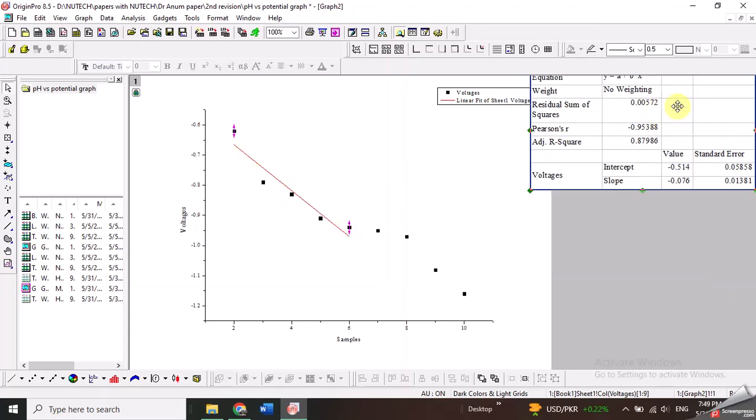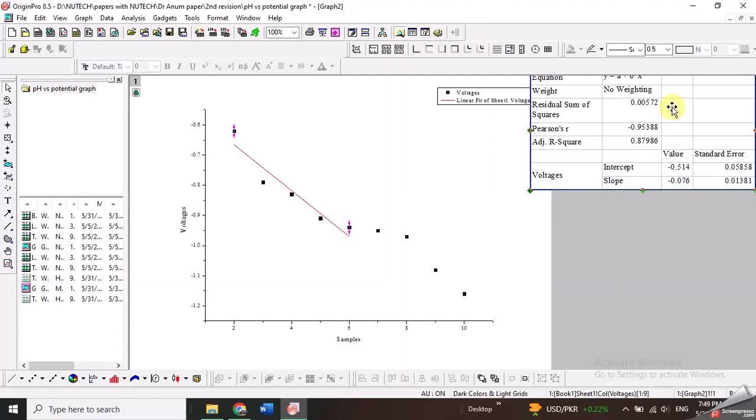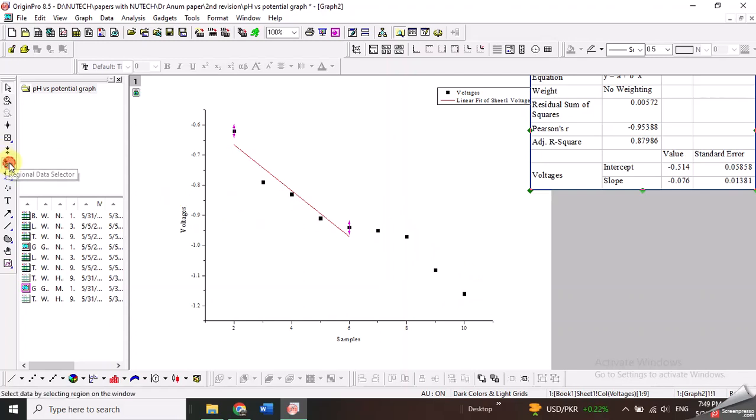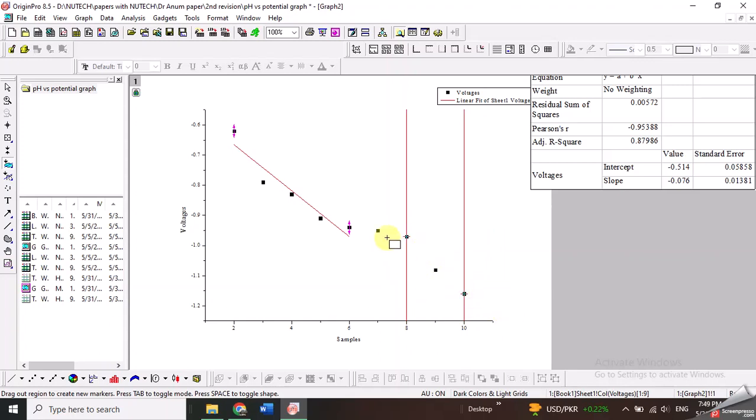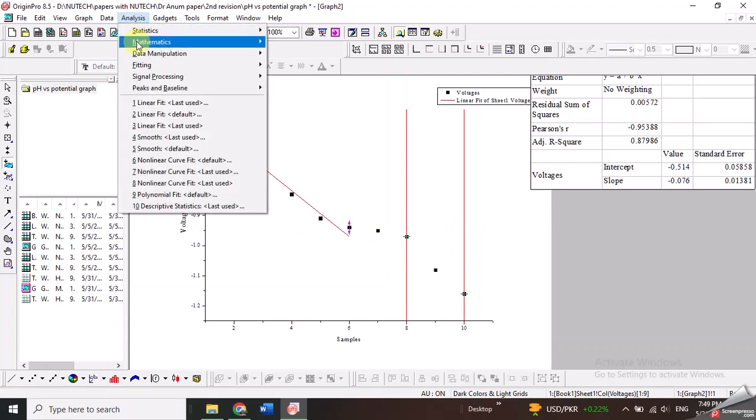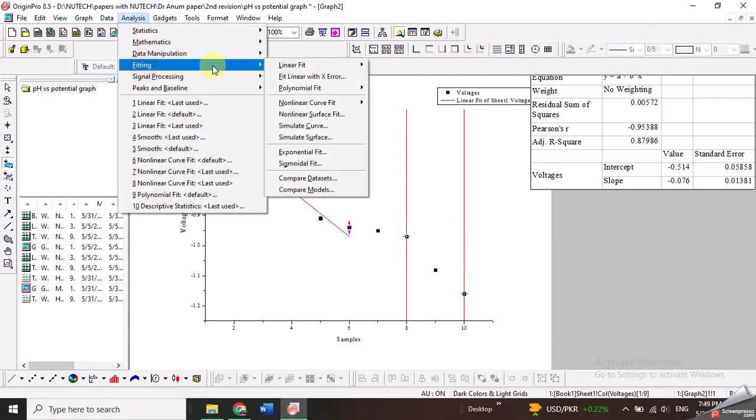Now I want to draw another straight line for these data points. Again, I will go to the regional data selector and click this region. You will again see these red lines which indicate the selected data. Go to Analysis, Fitting, Linear Fit.